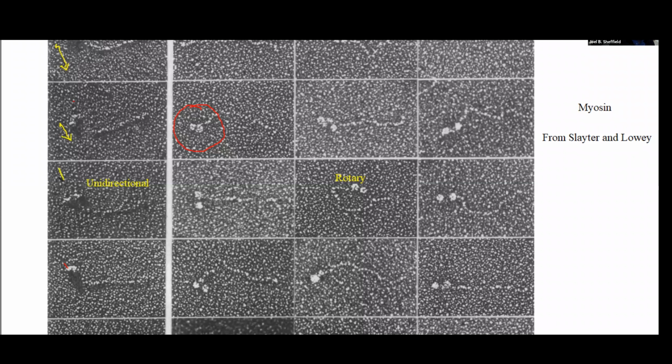And the question that they ask in this paper is if you do a one-directional shadow like this, can you make out the substructure of the myosin head? And their answer is, well, you can really stretch it. Maybe you could imagine once in a while you'll see something like this where there might be two pieces. But by and large, the shadow tends to obscure the secondary detail.